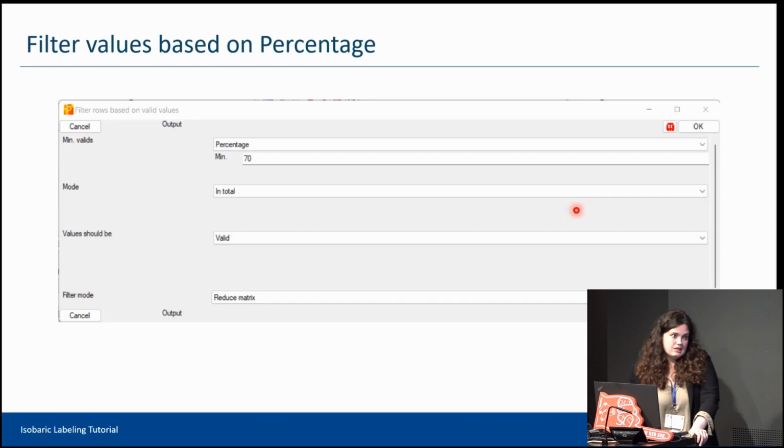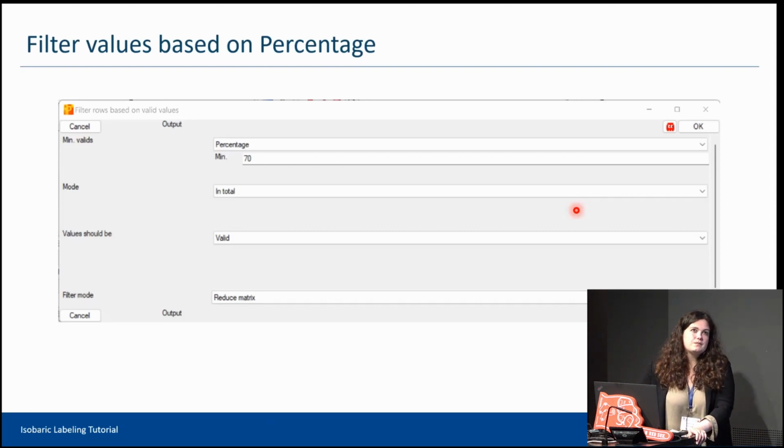In this case, I provide 70% like here, but also provide the Perseus with 100%, and you can see that there are not so many differences. I did it exactly to show you that you can play around with that, especially if it is your data. If there is something from the paper, you reproduce it as it is.